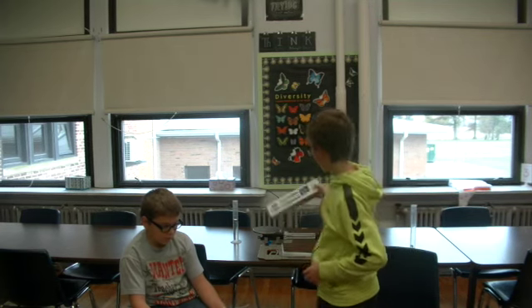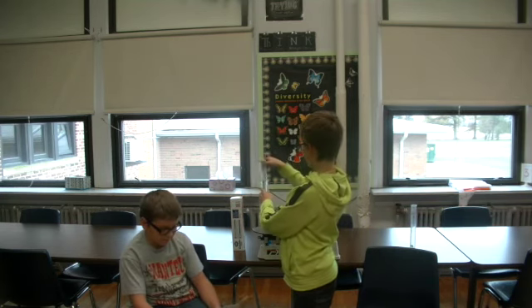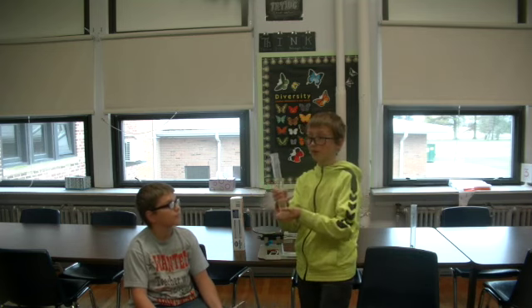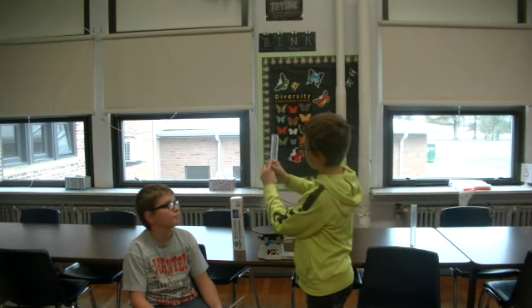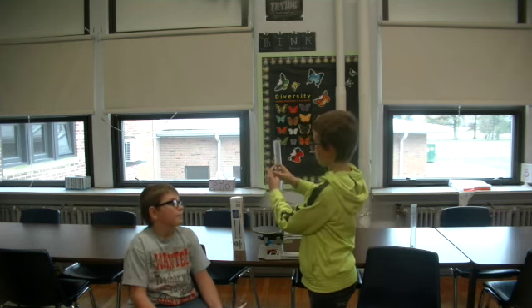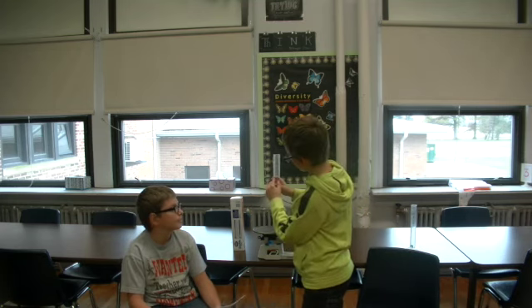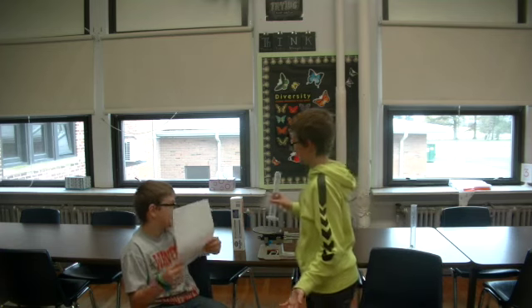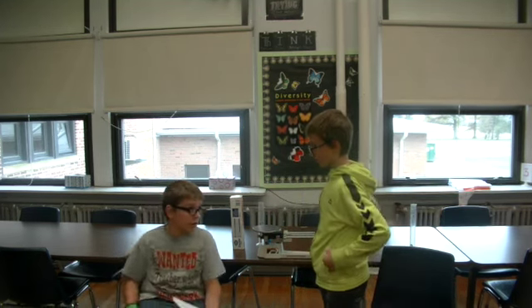Okay. So, well, what about liquids? Liquids? Well, as you can see here, first we just put water, or whatever liquid you're using, in the graduated cylinder, and then we measure however many milliliters there are, and 1 milliliter equals 1 centimeter cubed. So there is 69 milliliters of water. Yep. So it'd be 69 centimeters cubed of water. Nice. Okay, so I don't have more questions.